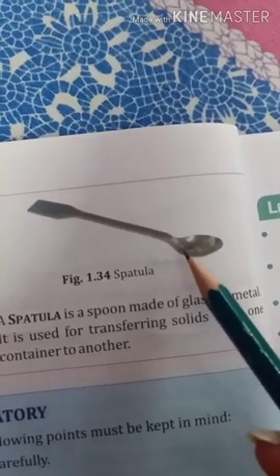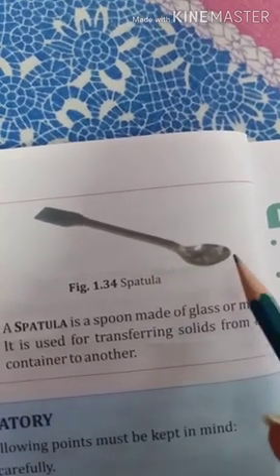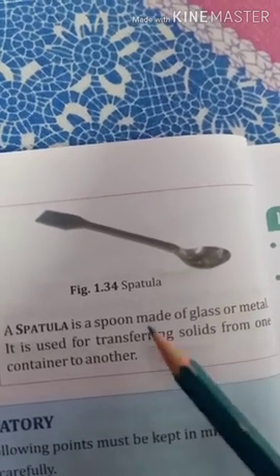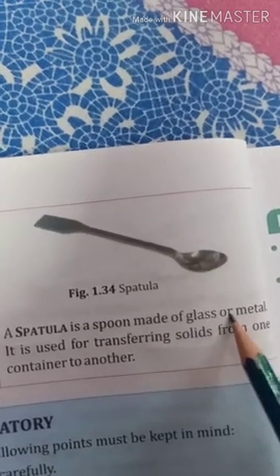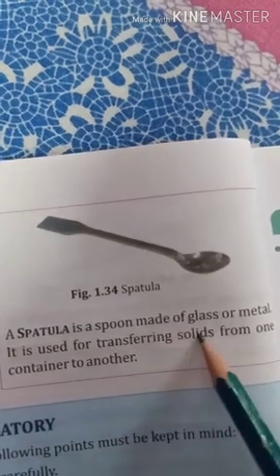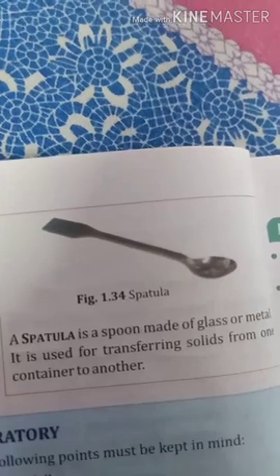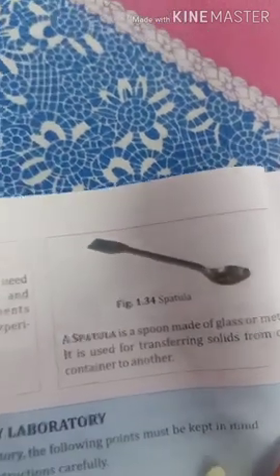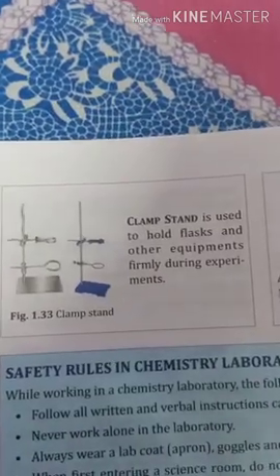This is a spatula, just like a spoon, and it is used to transfer solids from one container to another container. So a spatula is a spoon made of glass or metal, and it is used for transferring solids from one container to another. So this is all about the different apparatus used in a chemistry laboratory.